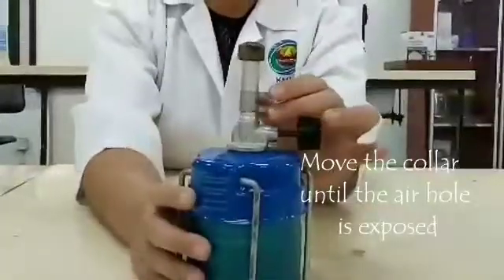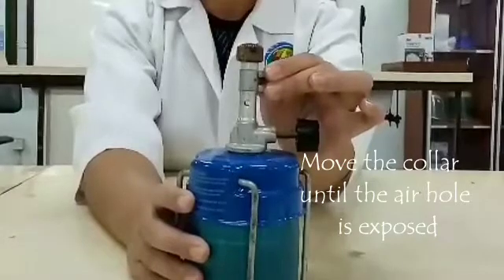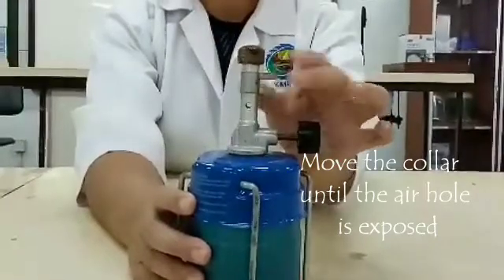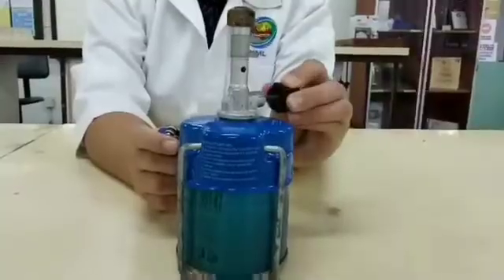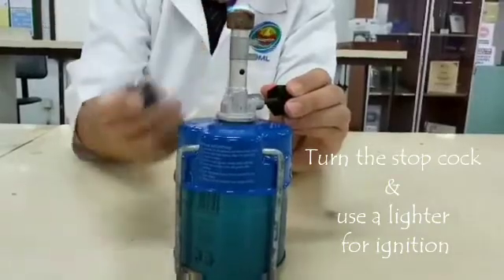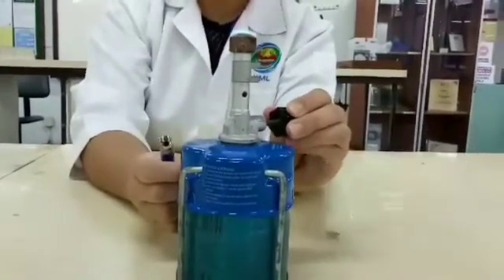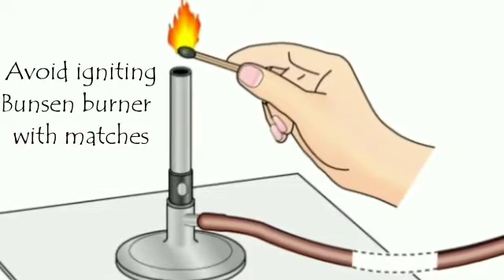Igniting the Bunsen burner. Move the collar until the air hole is exposed. Turn the stopcock and use a lighter for ignition. Avoid holding the lighter too close as the fire would be too close to your fingers.